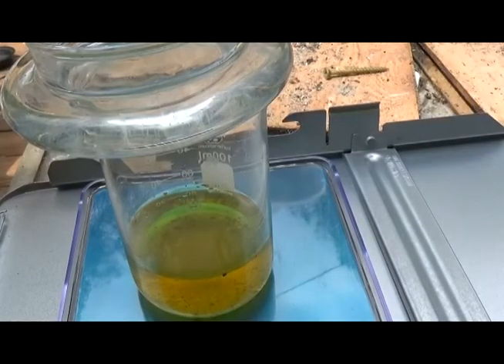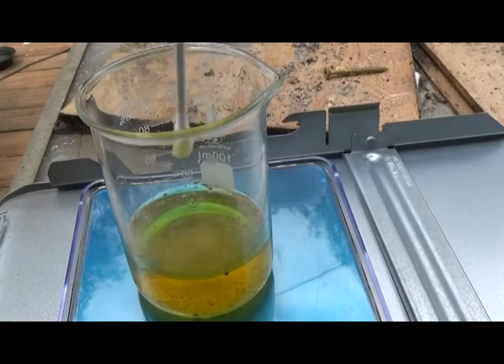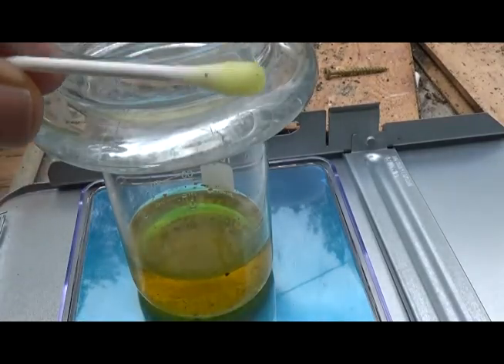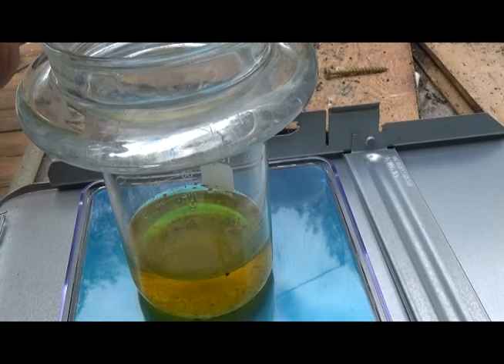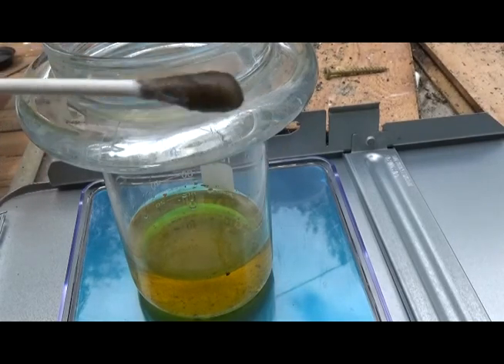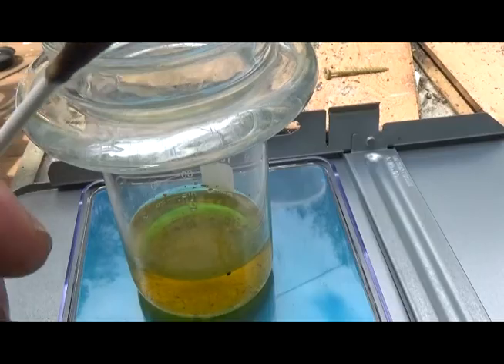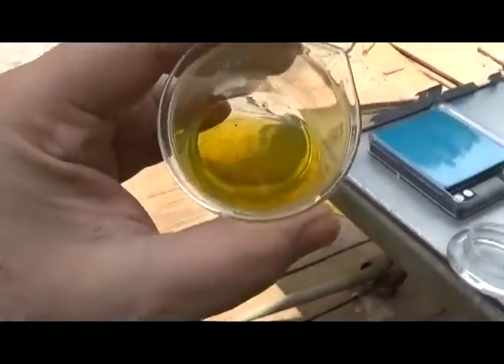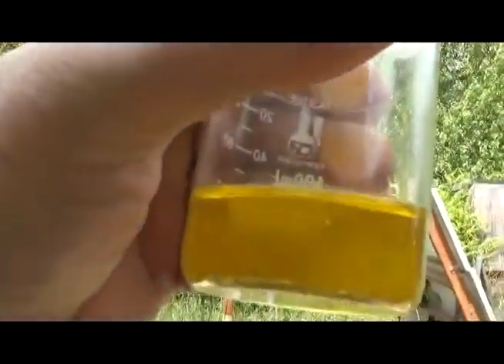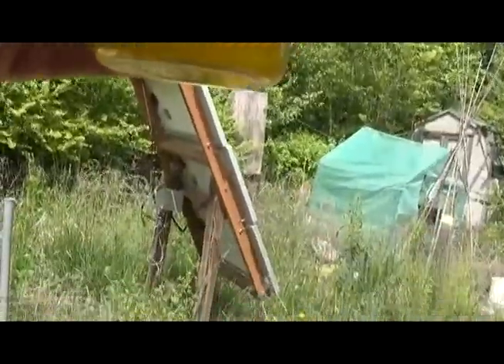We're going to do a stannous chloride test real quick to make sure we have gold in solution. It sure is a pretty color — lots of gold in solution, very heavily concentrated. What we have left in the filter is a bunch of trash — PCB parts, always some lead — but hopefully no tin, because the gold is staying in solution.